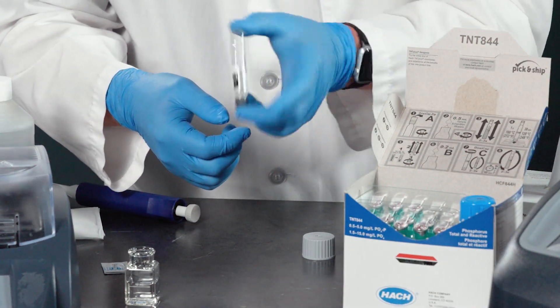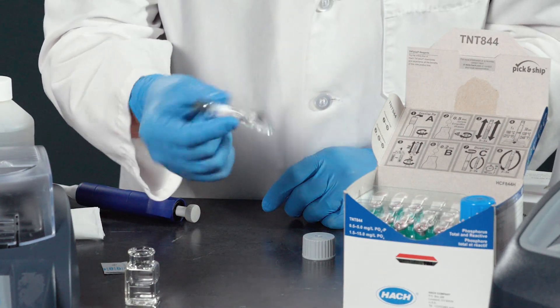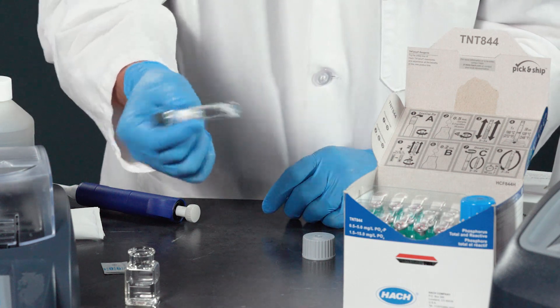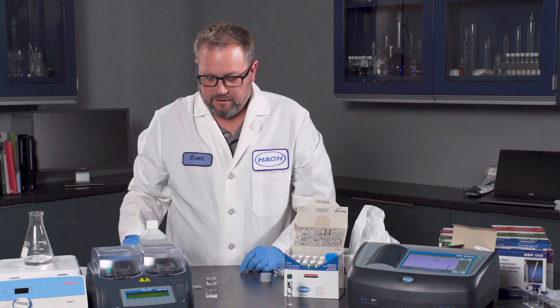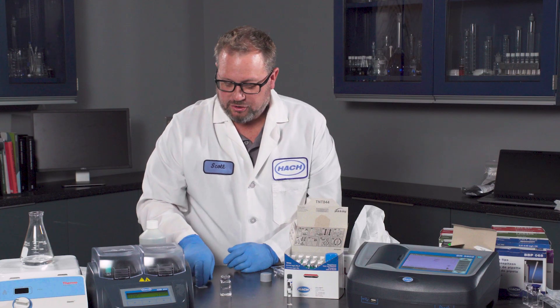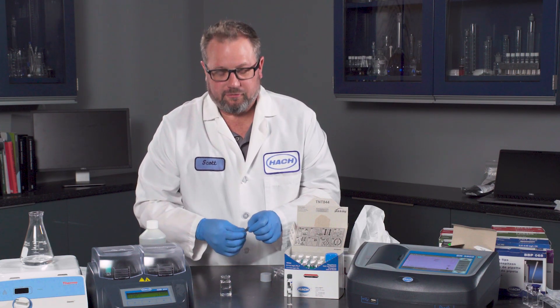Let it react for the 10-minute time period and it will turn blue if phosphorus is present. So we'll let it sit here. And then we're going to talk about the Phosphor-3 method — if you're measuring just phosphate, the Phosphor-3 method is perfectly good.